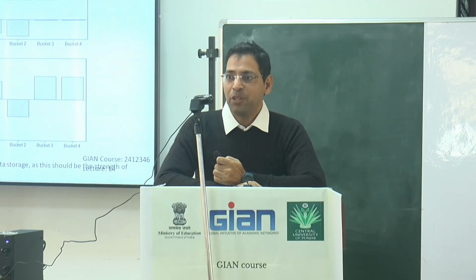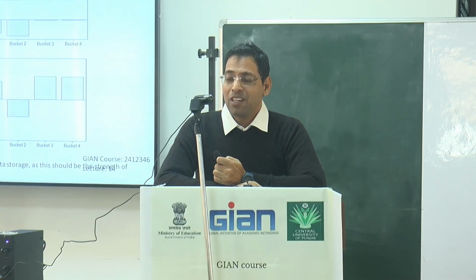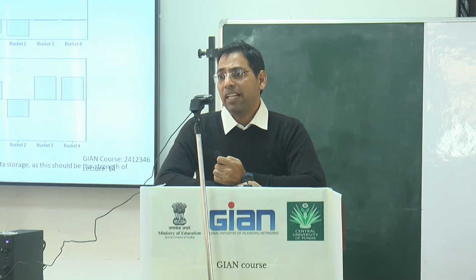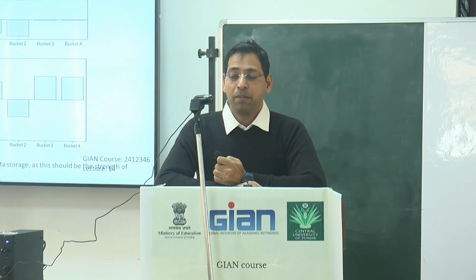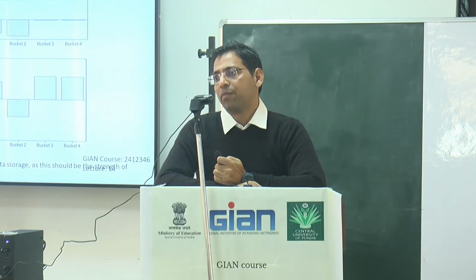But if you say that you want them to develop the method, and you are giving the sample only, then they will also ask for authorship. And remember, in those machines, the most important experiment is the method development. Method development is itself a data. And if you get a very good method, then the rest of the things is easy for you also.